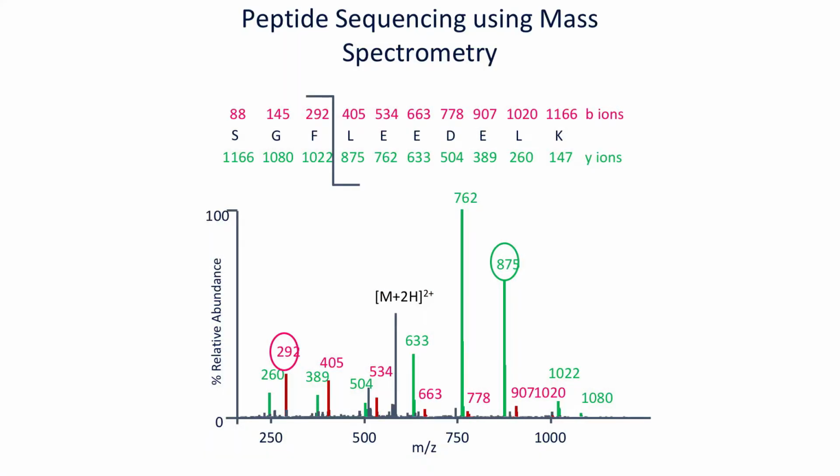And if there is no basic residue, it might be very difficult for us to detect. So, and then you have this peptide right here. Let's say this is a doubly charged peptide. Another reason why we like trypsin is because the N-terminus usually carries charge, and in the trypsin case, also the C-terminus. Again, HLA peptides might not be the case.